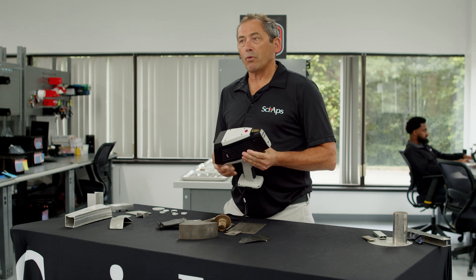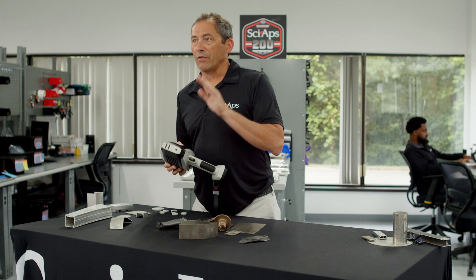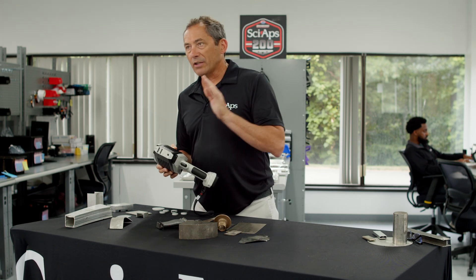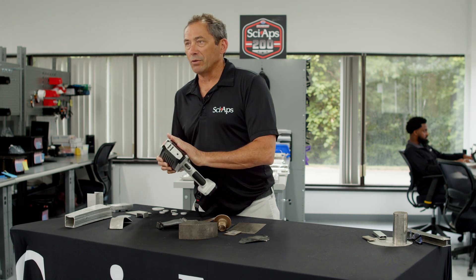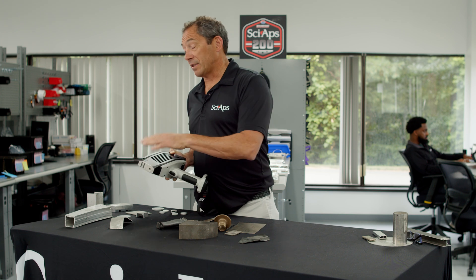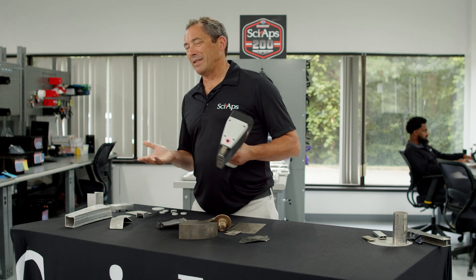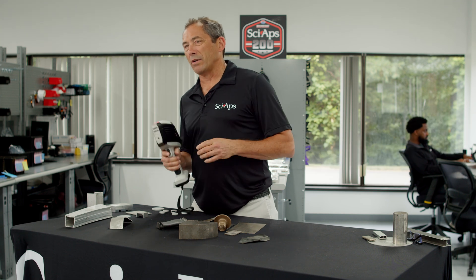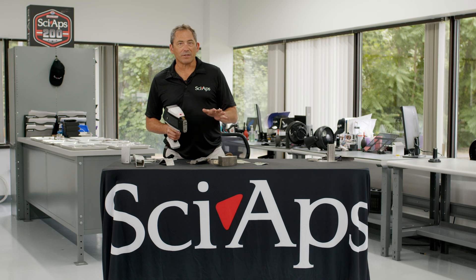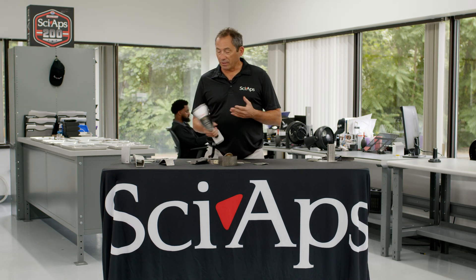The first thing I want to point out about this analyzer is it's got a much more powerful laser in it than the early LIBS put out by some of the other manufacturers, and that's really important because it burns through surface material, dirt — in the case of aluminum, it burns through the anodizing. That's great because it makes it easier to use. Your operators don't have to wonder, do I grind or do I not grind? They can just shoot stuff and test it, and that's really key to a simplistic operation that's also fast.